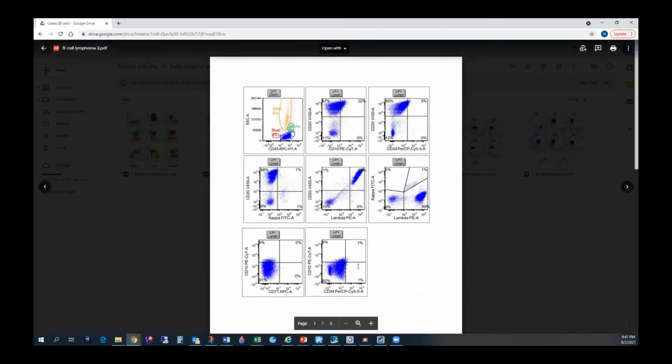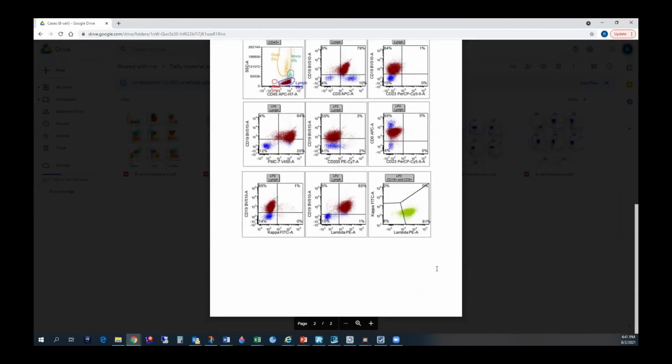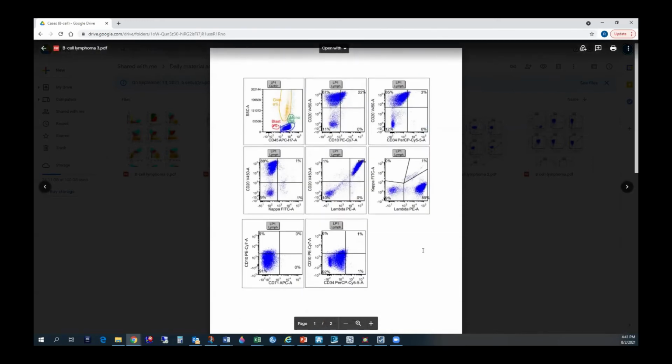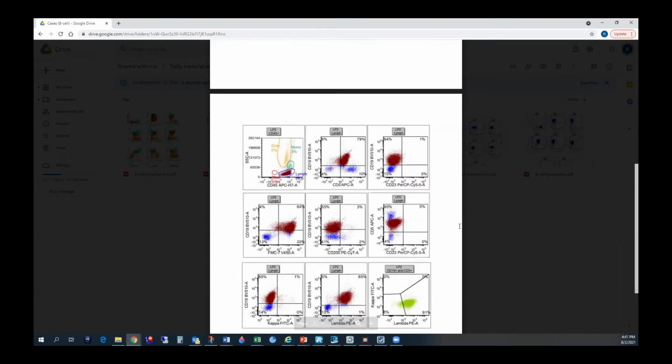But otherwise, your question is valid. Hairy cells are negative for CD5, so we won't usually do it. But in our regular tube, we have CD103. In my previous place, we did not do it unless we suspected, when everything is negative and it is a monoclonal population, then we added a hairy cell tube. I was just concerned with the brightness of CD20 and lambda was quite bright. Yes, that is something that would prompt us to do it, but because of the CD5, we would not have done it. Yeah, I get that.